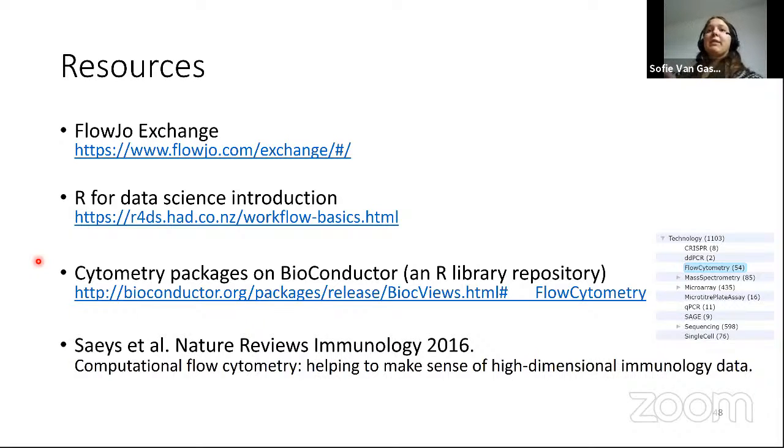And more specifically, if you're then wanting to start doing cytometry things, have a look at Bioconductor, which basically just collects all kinds of different libraries. They have a specific tag called Flow Cytometry, where you will see there's lots of packages available.